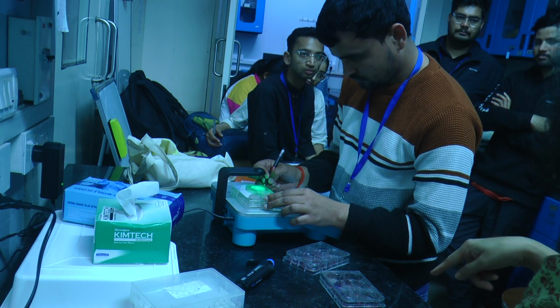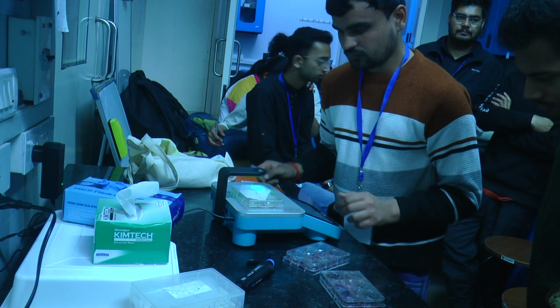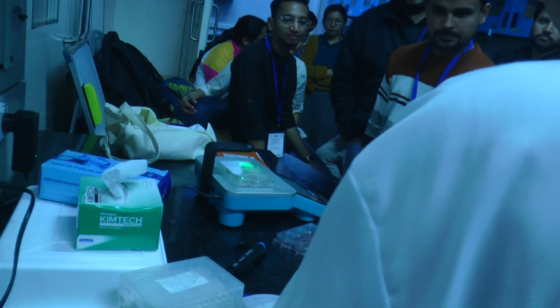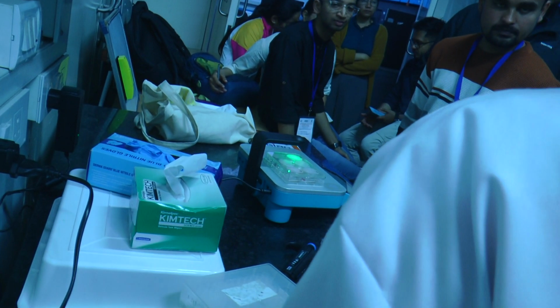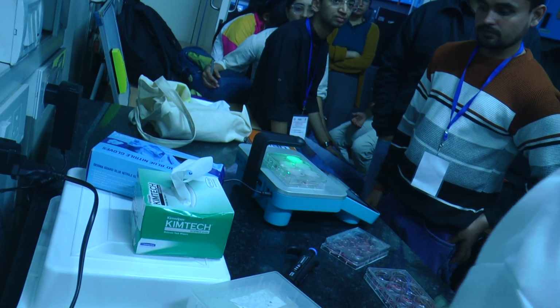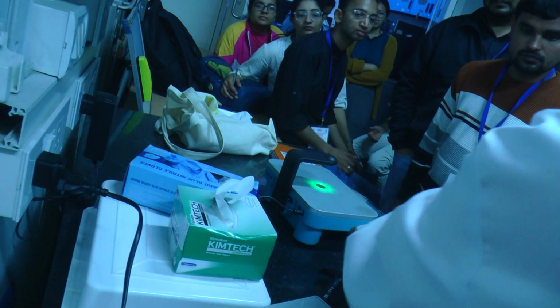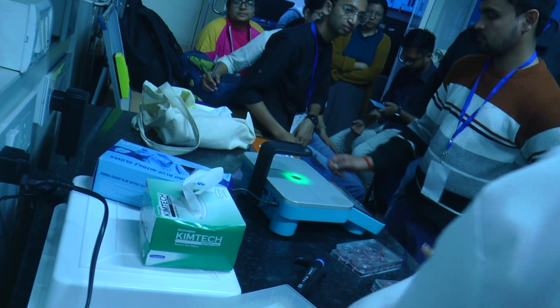Please empty. Empty? They look like empty. You can reuse these things. No, we can't. This is a one-time use. Okay, so now this other group can start till then, we can do the process.